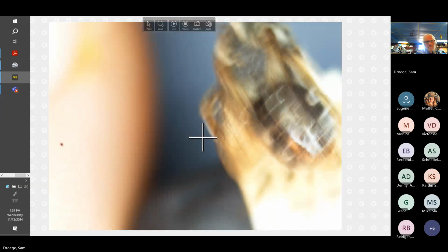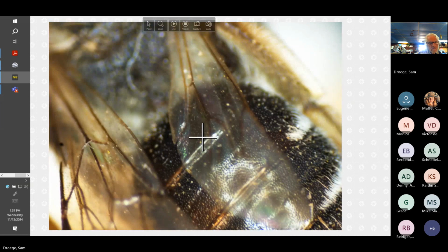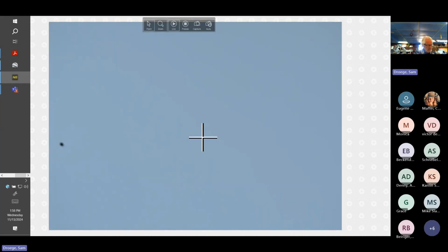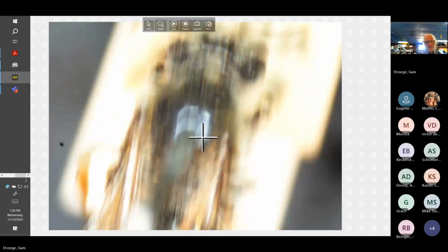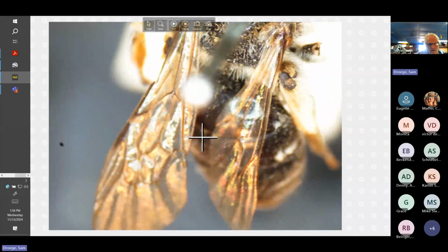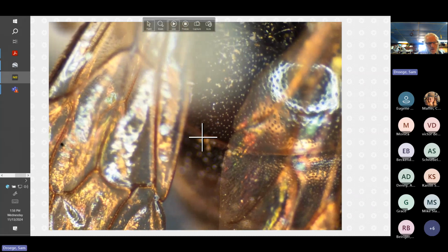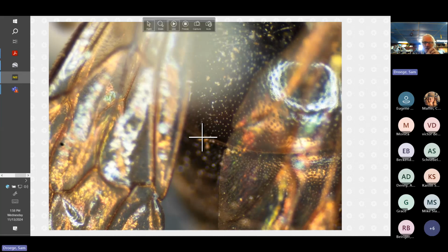And on T1, I'm going to bend that a little bit again. One good thing about this class, I've gotten better at moving things under the microscope online. Okay, so it's supposed to be 1 to 2 pit diameters. Yeah, you could call it that.